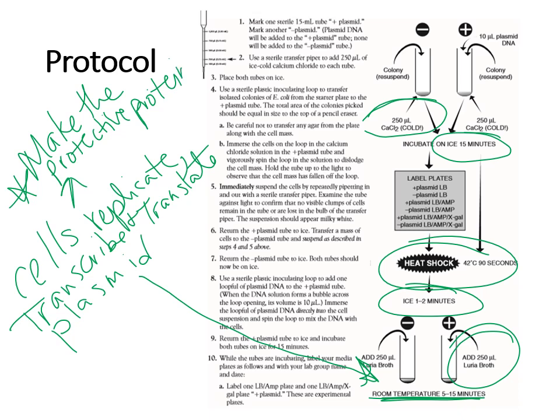Okay, so I know we already went through all of the steps, but I just wanted to give you an example on the protocol itself, looking at one of the actual steps, okay? And you can practice doing that for each step. What's the point of that first calcium chloride, of that ice step, of that heat shock, of this ice step? Whenever you go through a protocol, practice that.